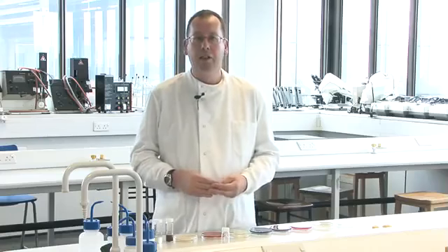After 24 hours in cooked meat, bacteria present in the sample have had the opportunity to multiply, increasing their numbers, and so there is a better chance of recovering them on solid media. So this technique is important as it is improving the sensitivity of culture. This is especially useful for the isolation of anaerobic bacteria as they may become injured due to exposure to air when the sample was collected.